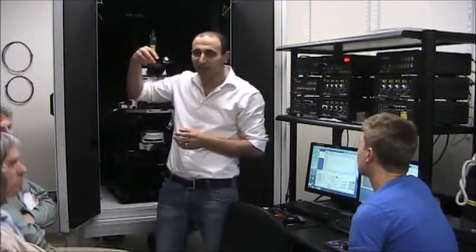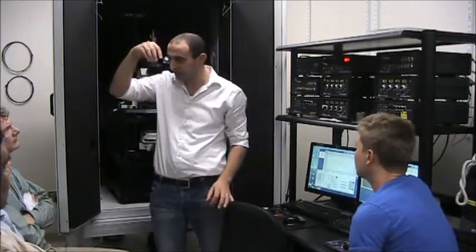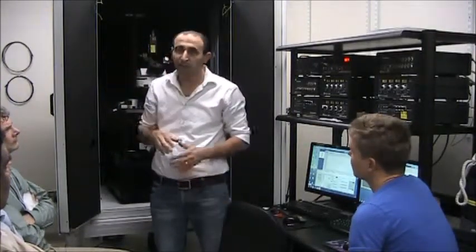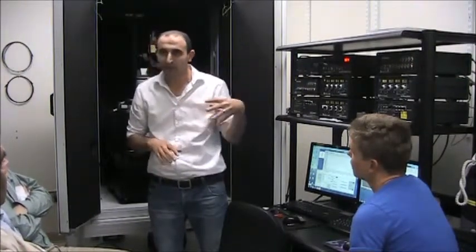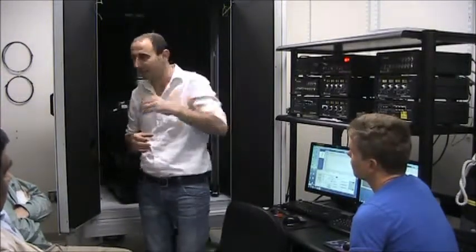You could see this in many systems from below, but only a few systems can give you a nice, clear optical axis from the top. And that is very important because most of the samples for AFM are opaque. So that's why people use, for example, a side view, but it's still not effective. If you work with optics, you better work in orthogonal directions, and not at an angle.